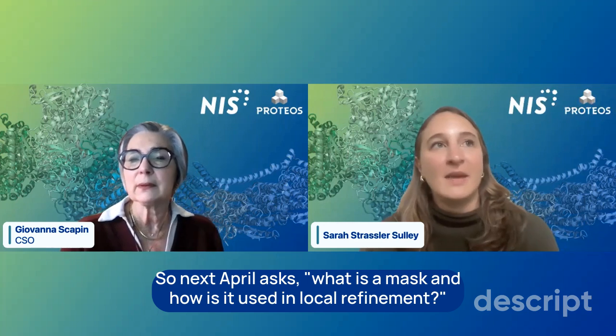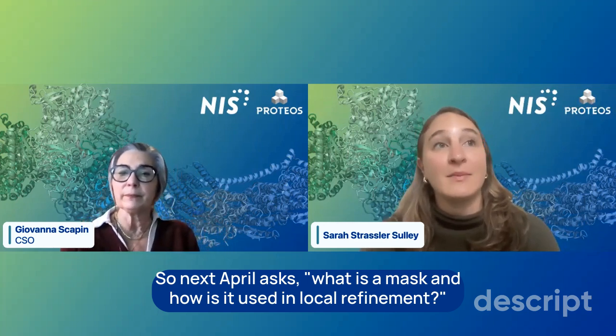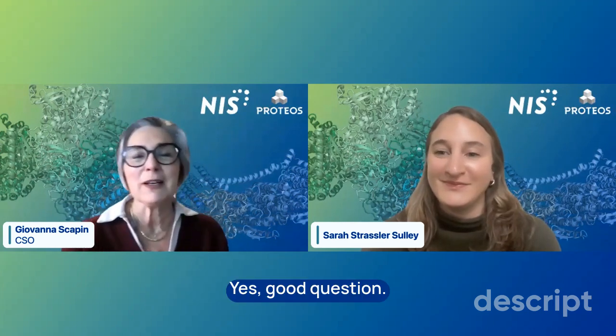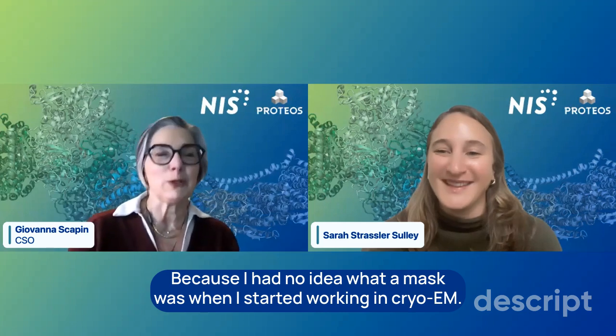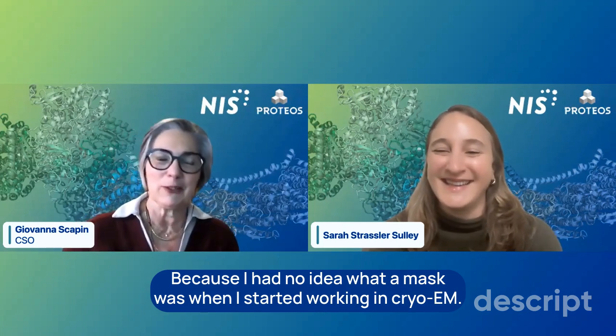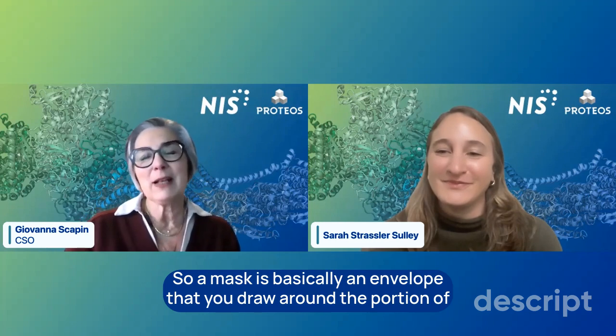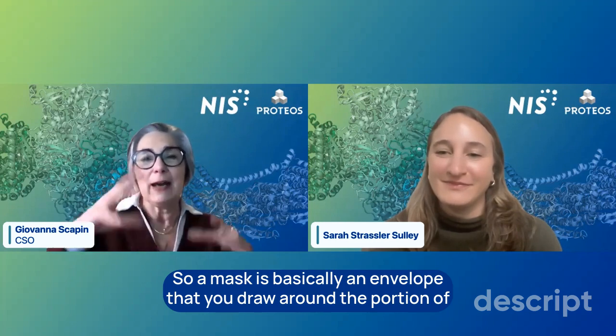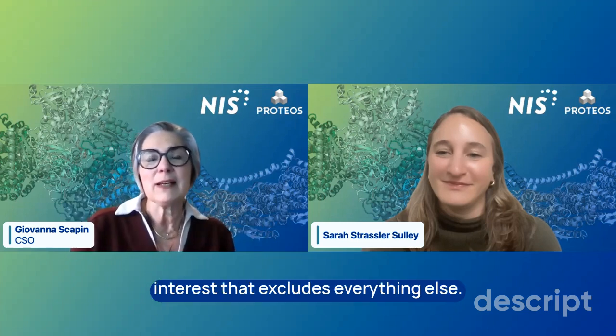So next, April asks, what is a mask and how is it used in local refinement? Yes, good question. Because I had no idea what a mask was when I started working in Cryo-EM. So a mask is basically an envelope that you draw around the portion of interest that excludes everything else.